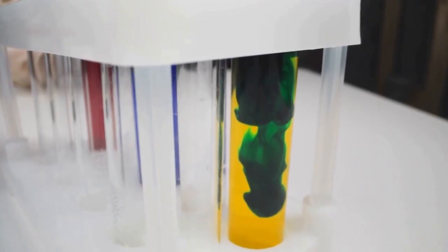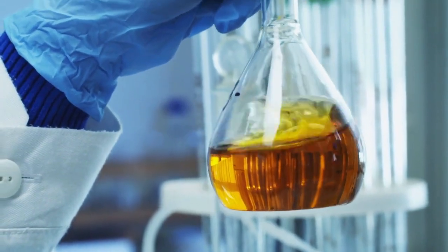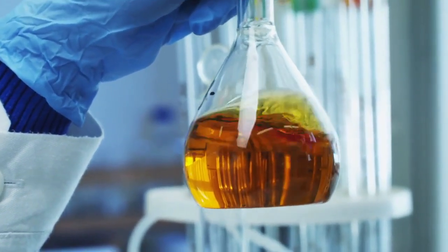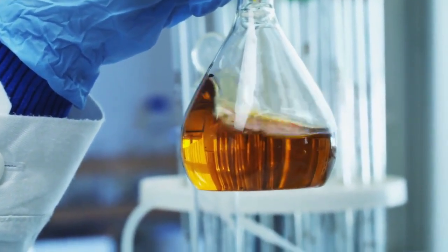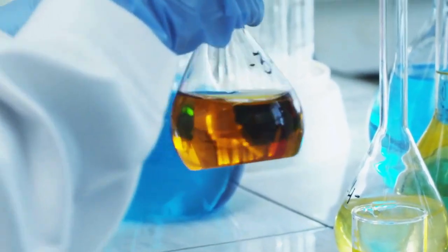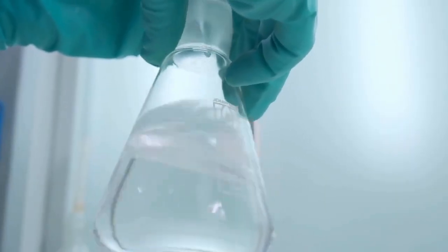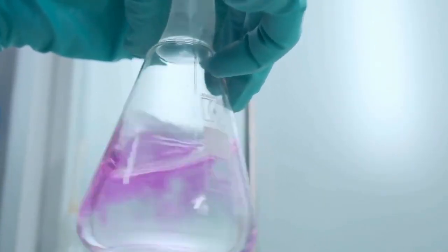Think of TLC as a race. You have a stationary phase, which is usually a thin layer of silica gel on a plate. Silica is very polar. Then you have the mobile phase, which is the solvent or mixture of solvents that climbs up the plate. Your chemical sample is spotted at the bottom, and the race begins.